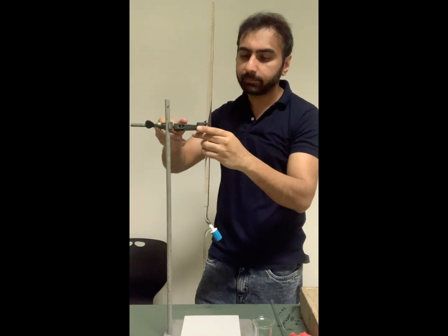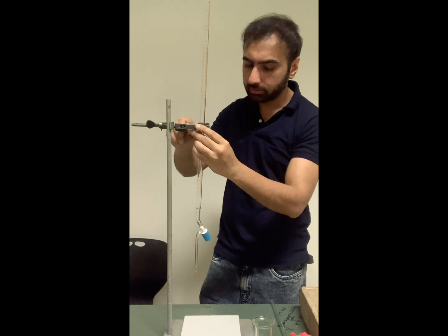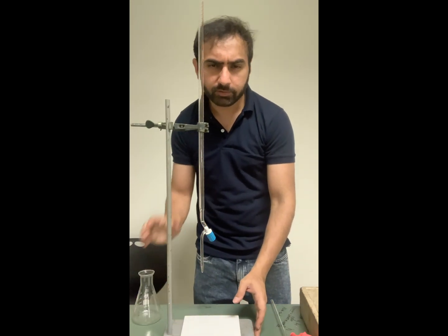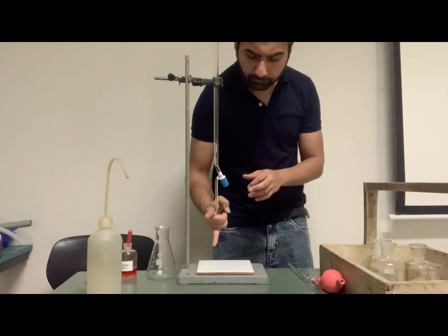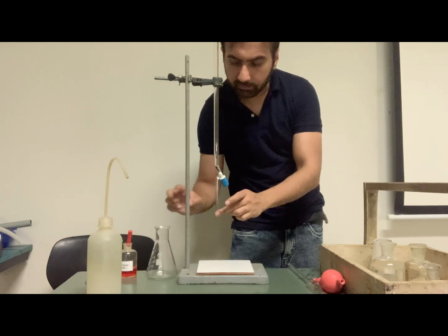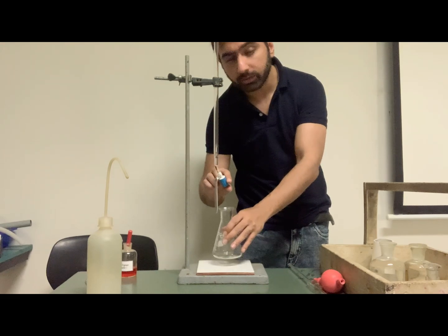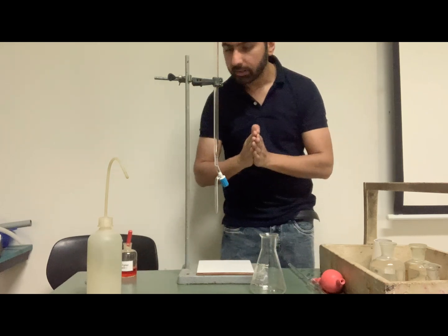I'm placing it back into the clamp. You can see it has enough height on top of the white tile. You have to make sure that there is enough space between the end of the nozzle and the white tile so your conical flask can easily fit in, because you will be working with the tap and the conical flask at the same time.